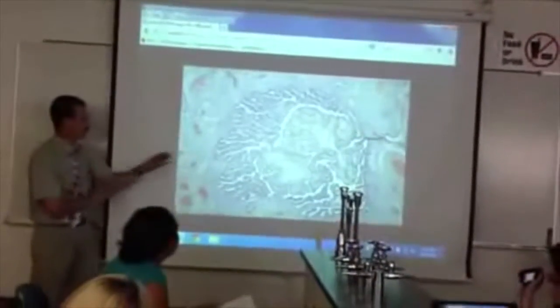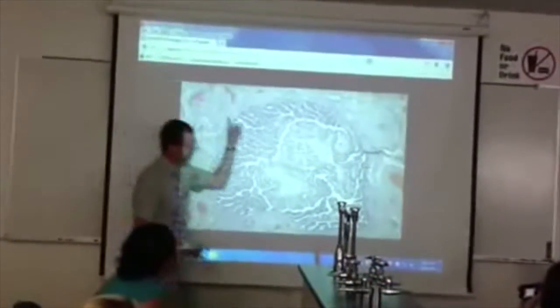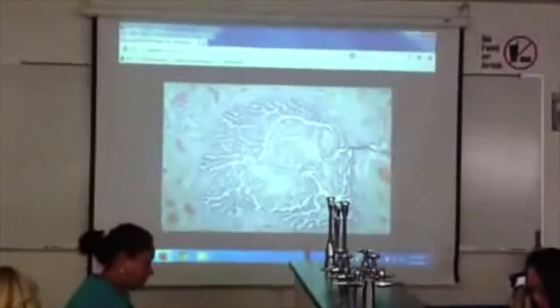Uterine tube. Normally this would be thicker. That's the snowflake, but they didn't have a thick enough gland. That's the snowflake, which looks like a vesicle. Let's try.